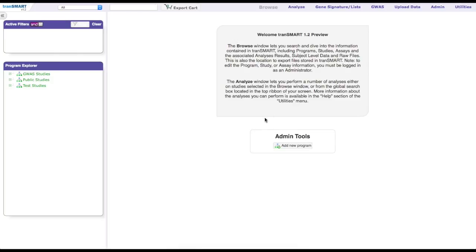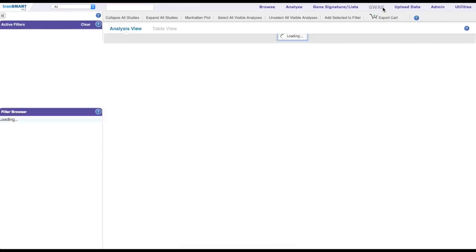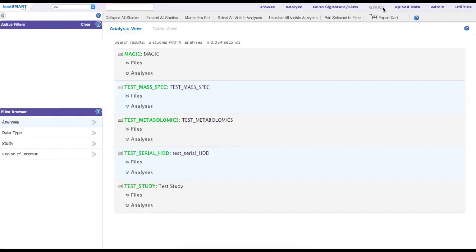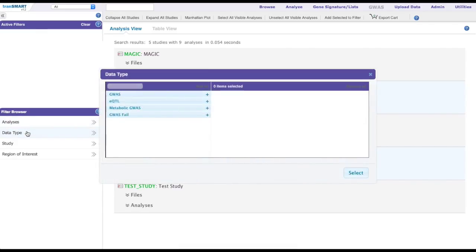The GWAS feature is found on the GWAS tab on the top of the menu bar. The studies can be filtered using the filter browser on the left-hand side of the main display, for example filtering based on GWAS genes or EQTL express genes.